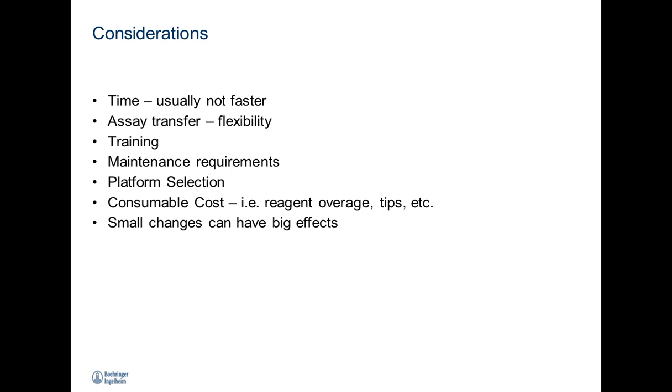Selection of the platform is obviously very important, and this is where loyalty to a particular brand or vendor is not going to serve you well if their instrumentation doesn't have the capabilities that you need. Some people know one type of instrument, or one type of plate reader, and that's the one they want to stick with because they're familiar with it. But sometimes there are better options out there for your specific needs that need to be considered.